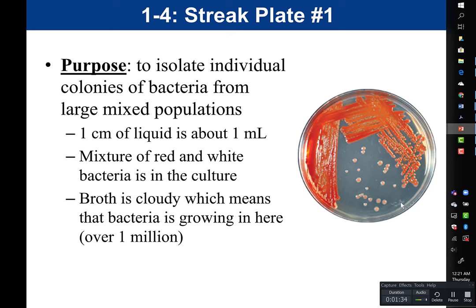Our first streak plate is going to be a mixture of red and white bacteria, so we can see if we can isolate the two types — meaning do we get some colonies that are red and some that are white. The broth, the original culture, is cloudy, which tells us that bacteria is growing in it. When we refer to a broth as being cloudy, we call that being turbid.